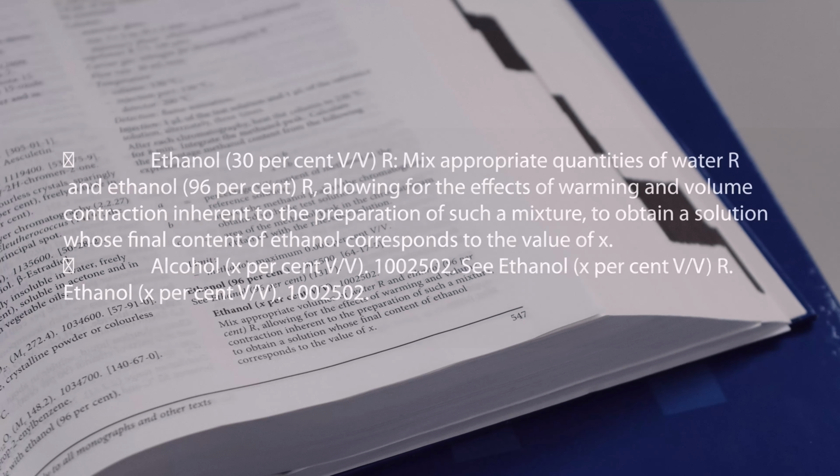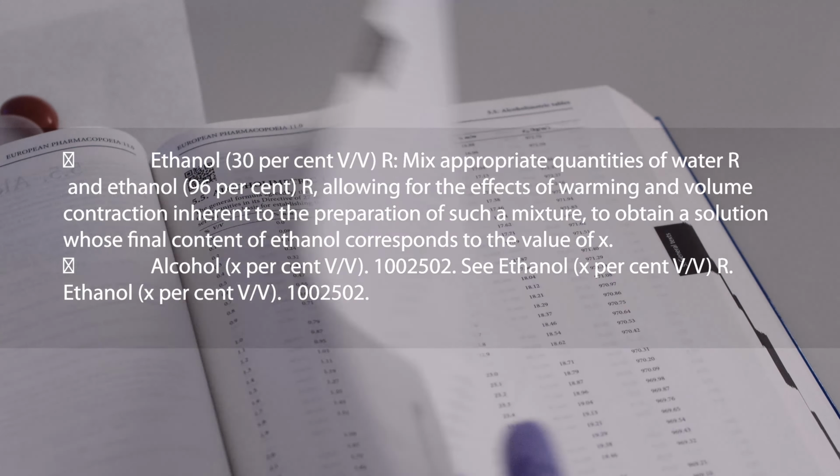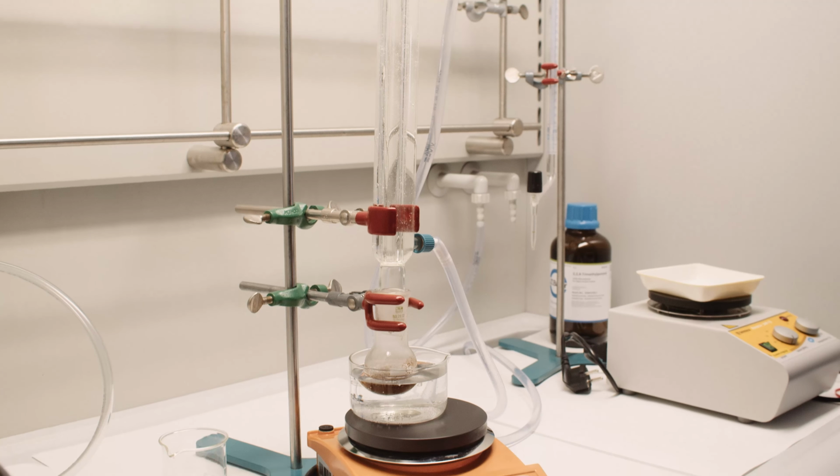Ethanol is prepared with the help of alcoholimetric tables found in the pharmacopoeia. Due to volume contraction, the mixture cannot be prepared by dosing volumes. Since the boiling point of ethanol is 78 degrees Celsius, we heat under reflux to avoid the loss of solvent due to evaporation. The procedure is suitable for active substances soluble in ethanol. Ethanol also has a greater ability to dissolve structures in cell walls, to soften the herbal drug and release the active substances from the solid structure of the bark.